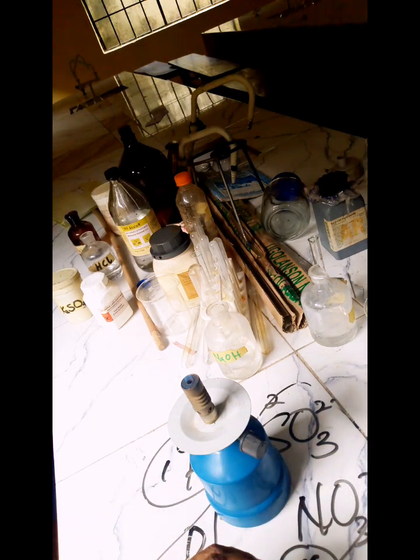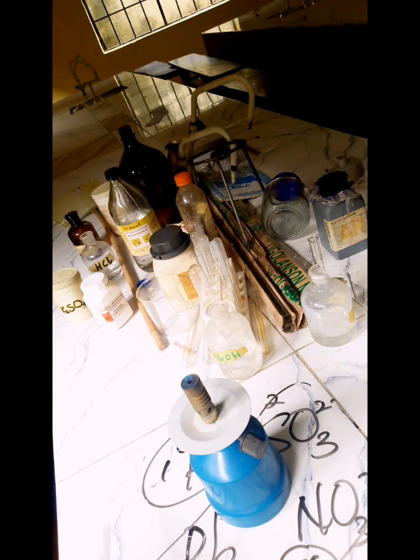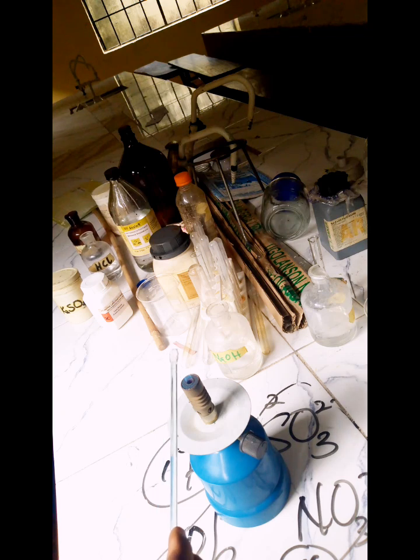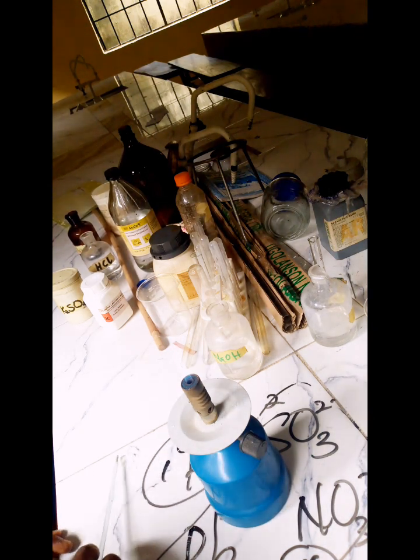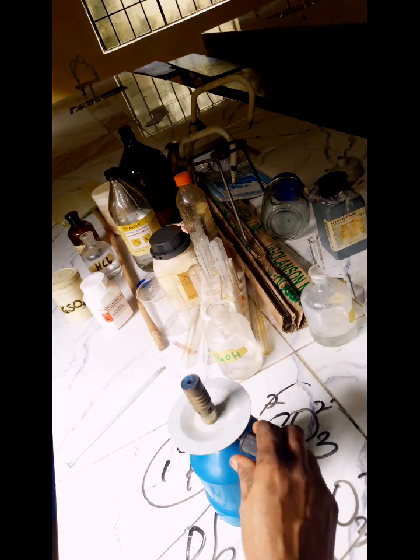Let's add a little more hydrochloric acid on it and collect more sample of the salt again for the test. So this is the flame test. That's lilac. See, lilac. It's a typical feature of potassium salt. That is how potassium is confirmed.